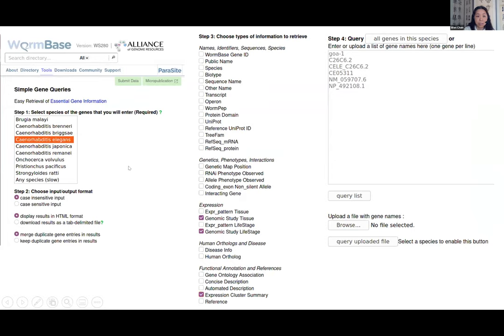Simple Mine is a handy tool for researchers to get essential gene information for a list of genes. It covers nine nematode species and can output HTML display or a tab-delimited file. Simple Mine is great for converting gene identifiers and names across databases, and for getting genetics, phenotype, and interaction information. Under the expression widget you'll see 'Genomic Study Tissue' and 'Genomic Study Life Stage' — anatomy and developmental life stage data derived from high throughput data. Under Functional Annotation, choose 'Expression Cluster Summary.'